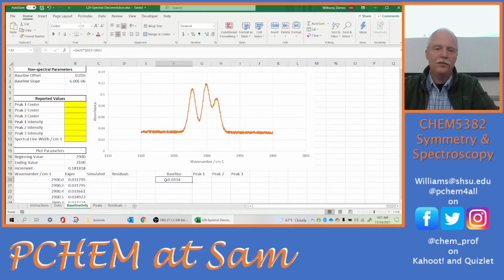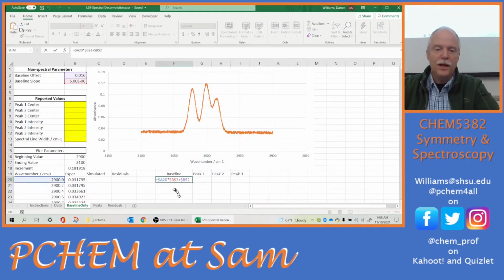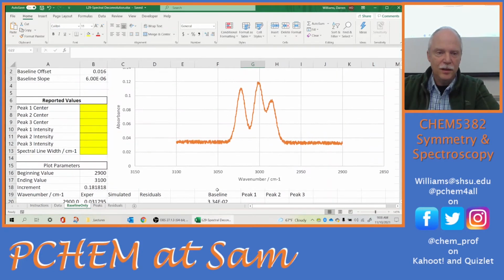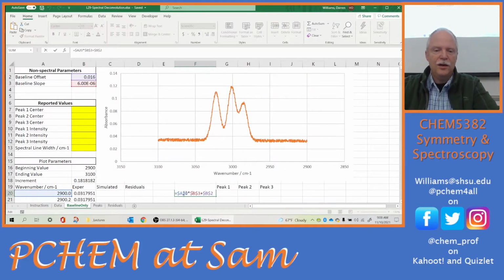So we come down here for our baseline function, and we have, yes? Let me make sure. Yes, it's recording, yeah. Okay, so look at my formula here. I'm going to go ahead and increase the size of this. So if I click on that, no, too big. Okay. So you see the color coding. I have mx plus b. So m, this b3, that's the slope, times x, my wave number value, plus the offset. Okay, does that make sense to everybody?